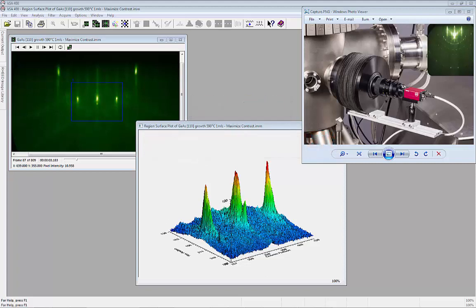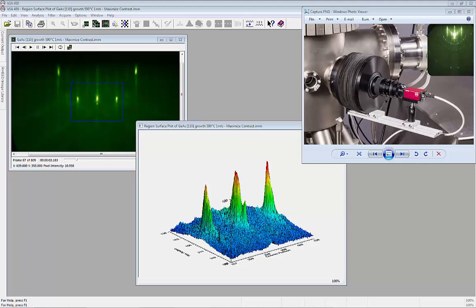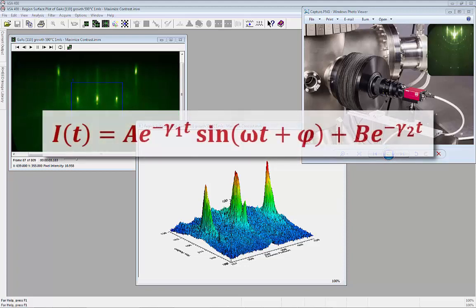In the case of layer-by-layer, also known as Frank-Van der Merwe growth, the intensity of the RHEED spots oscillates with a period equal to the time required to deposit a single monolayer. Note that this does not apply to step flow or island growth. These oscillations can be fitted by a damped sine function to determine the growth rate in monolayers per second.